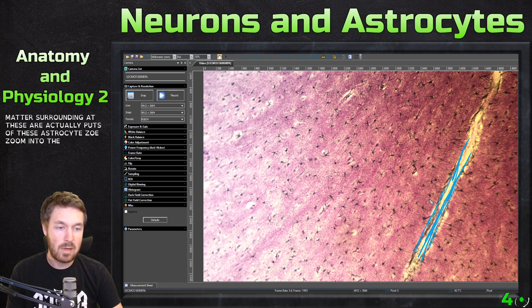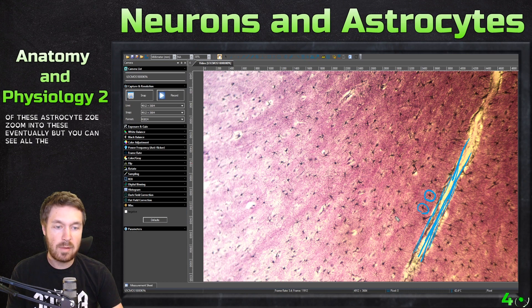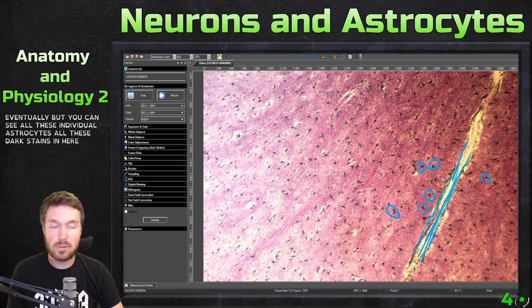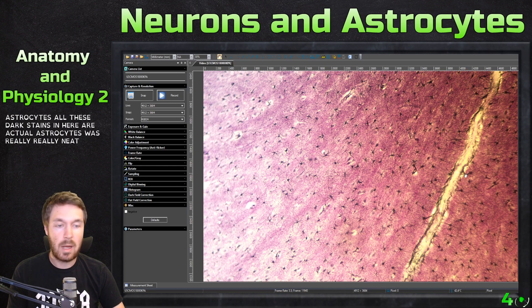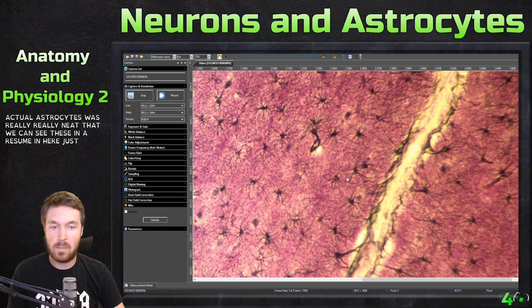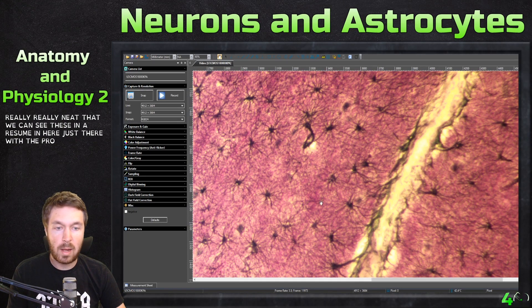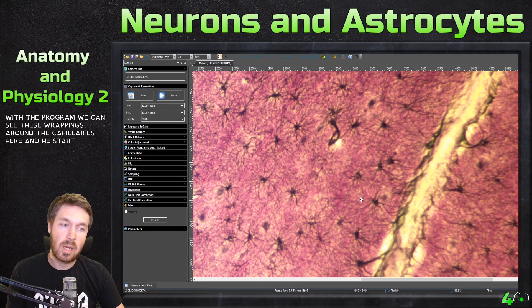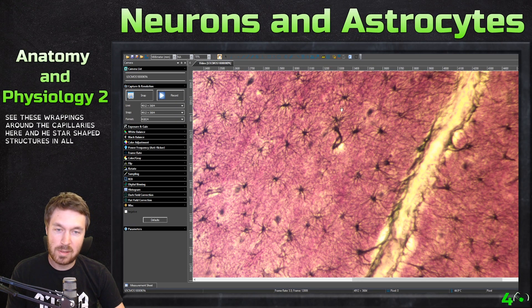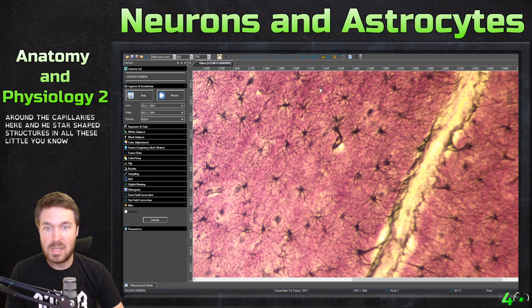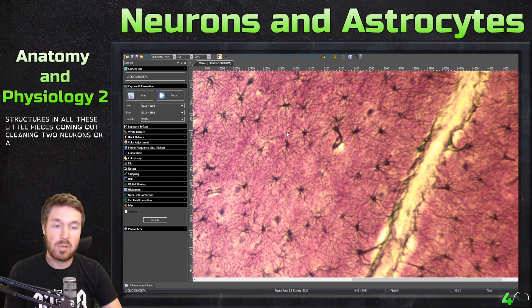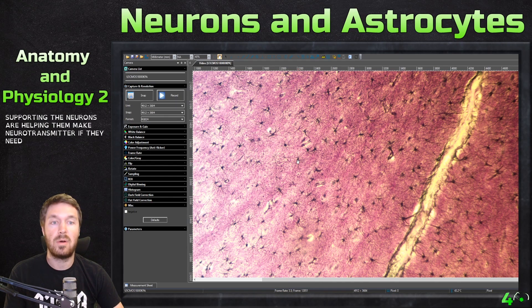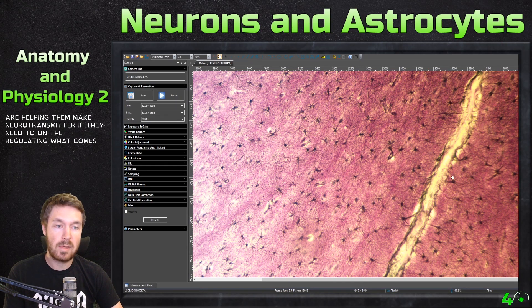And then you see this dark matter surrounding it — these are actually feet of these astrocytes. You can see all these individual astrocytes; all these dark stains in here are actual astrocytes. If we zoom in, we can see these wrappings around the capillaries, and these star-shaped structures with all these little pieces coming out, clinging to neurons around them. So they're supporting the neurons, helping them make neurotransmitters if they need to, and regulating what comes through these capillaries.